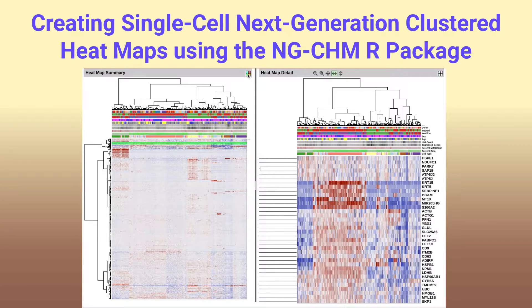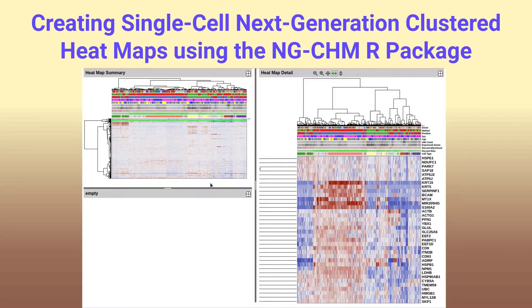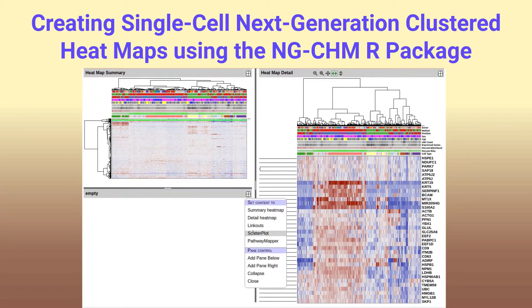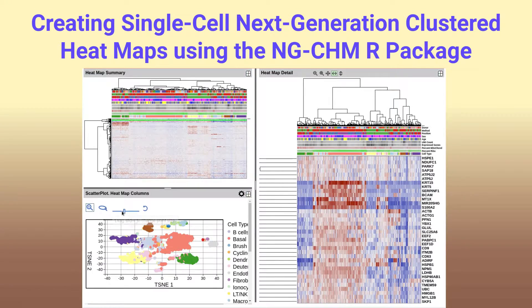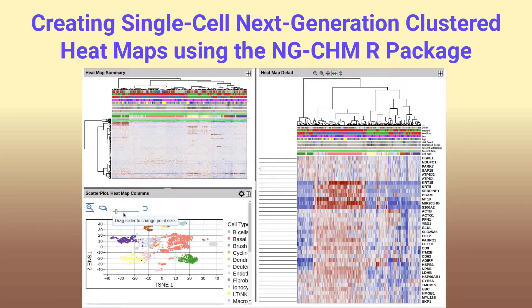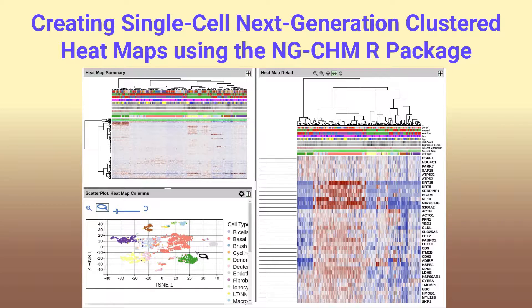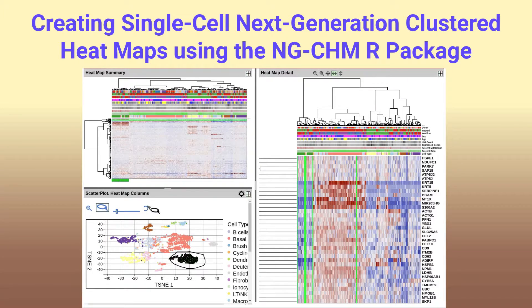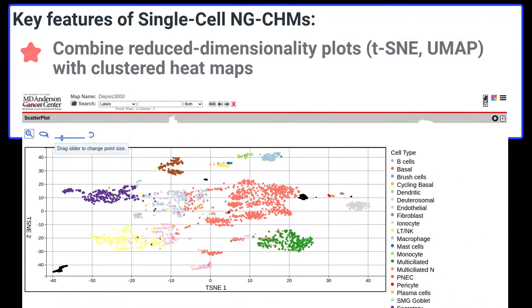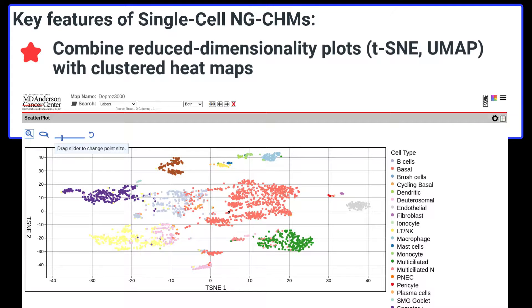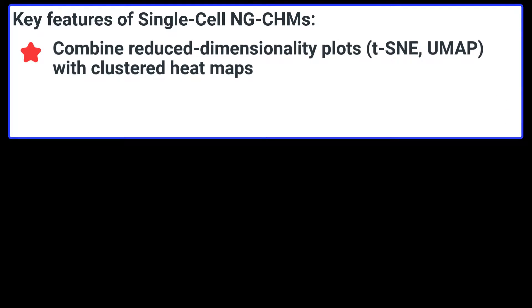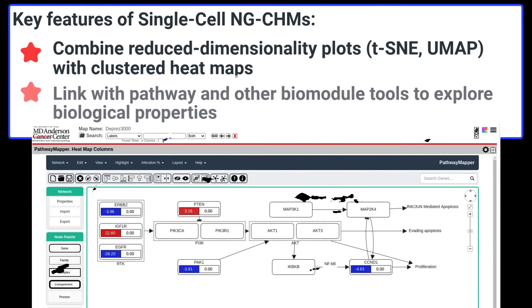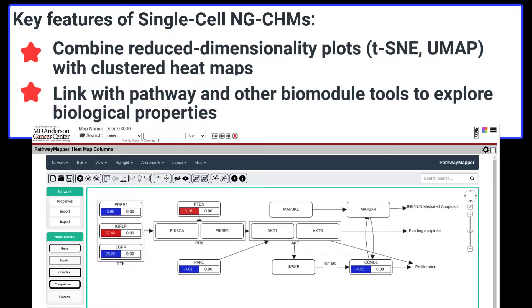This tutorial demonstrates how to use R to create a single-cell next-generation clustered heatmap or NGCHM like the one shown. Briefly, the key features of single-cell NGCHMs are that they let you combine reduced dimensionality plots like t-SNE and UMAP plots with clustered heatmaps for interactively exploring the underlying data, and link with pathway and other bio-module tools to explore the biological properties of the clusters.